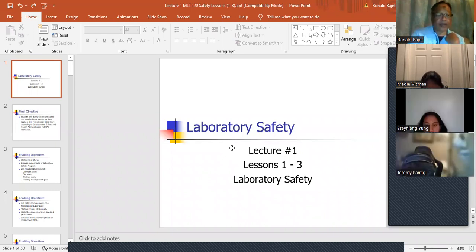Candida albicans is an important yeast that causes thrush. It's a very common yeast. It's reportable, and it can cause problems, so we'll find ways to identify Candida albicans. One of the quick ways is called the germ tube test, and I'll show you how to do that. Then Microsporum audouinii, we won't handle that. Audouinii, Microsporum canis, Trichophyton mentagrophytes.